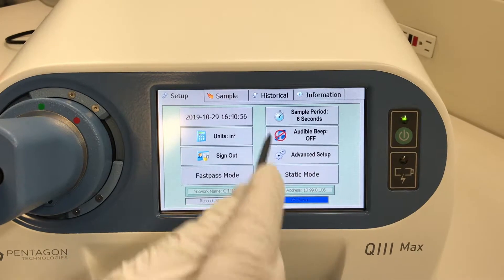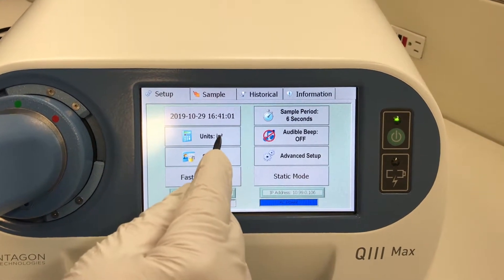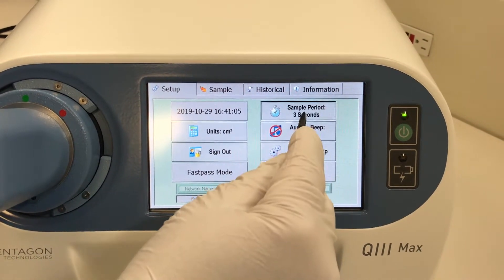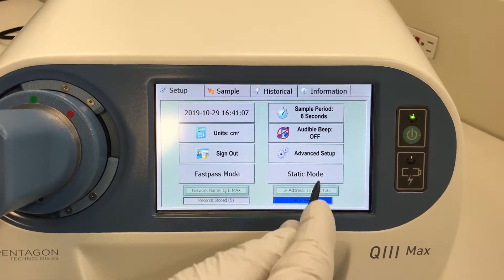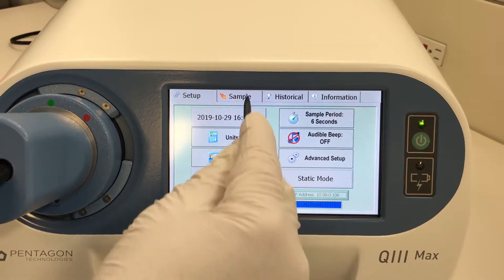After logging in you are in the settings page and it is essential that you apply the correct settings before making measurements. You can notice how you can toggle between different settings by touching the buttons.